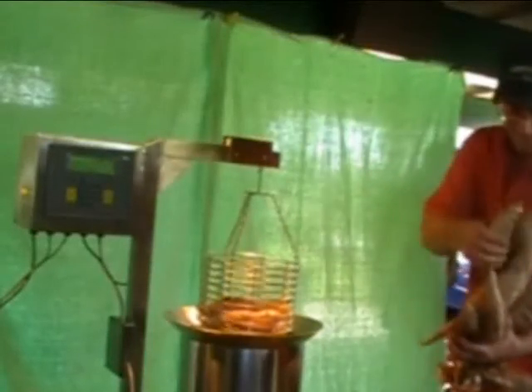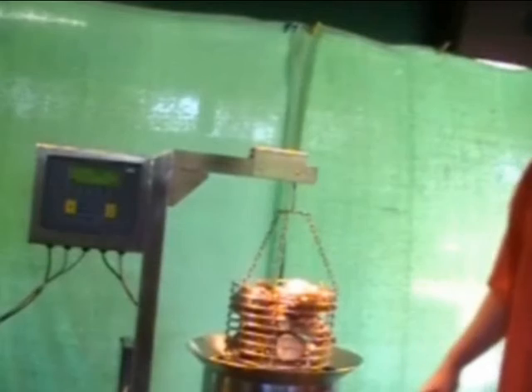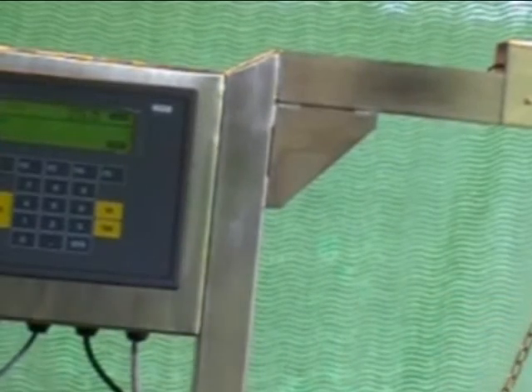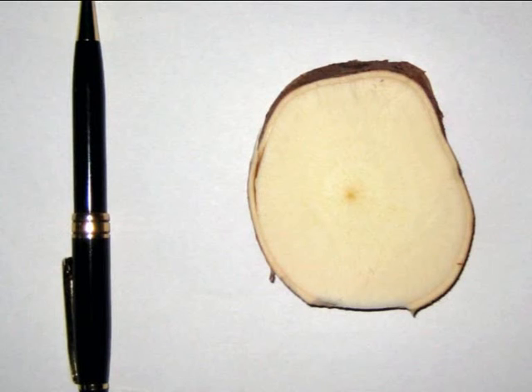The starch content is then determined using an automated buoyancy meter. As you can see, the starch content is 25.5%. A root cross-section shows the flesh to be of exceptionally high whiteness, indicating the starch is very pure. The high purity means it will be an ideal feedstock for the manufacture of starch derivatives and fermented products.